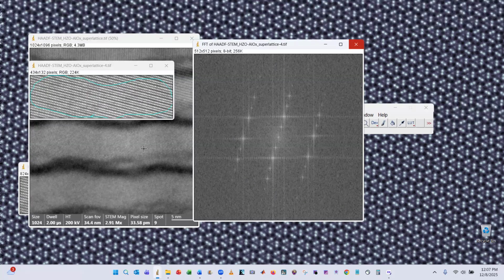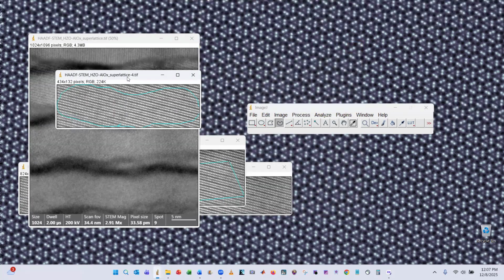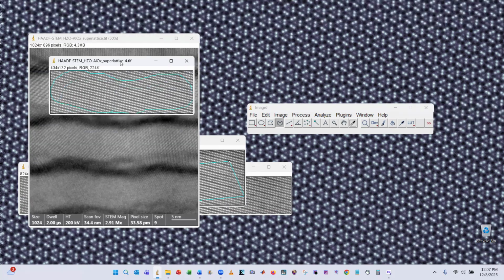So when you're doing this, ImageJ is creating a padded image. It may have some kind of windowing on it. Considering the difference we saw between the manually padded image and the one that's just directly computed, that's probably the case because we saw the reduction in the cross-shaped artifacts. But yes, that is the additional video that I wanted to show you.